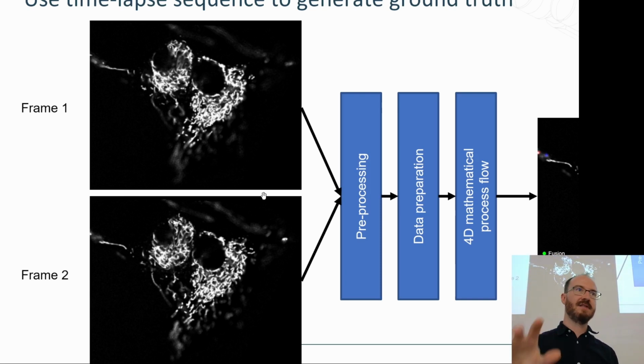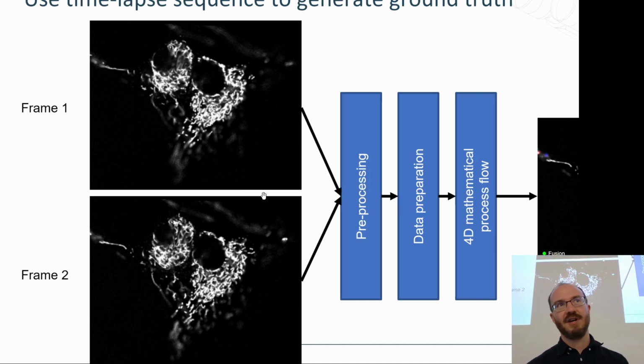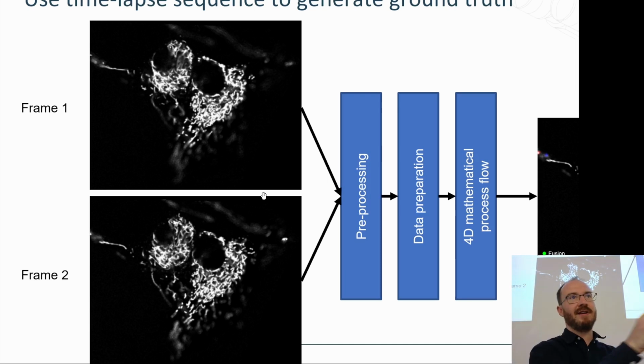This is the one structure. Now there are two structures associated to this one structure. So where between these two structures would that fusion point have happened, or fission point have happened? Like you understand, I need two structures to start to consider even where the location is. Because what if it just depolarized when you lost it? If there's something here and then nothing here, then you say, okay, well, in the same spatial area, there was something, now there's nothing, so it must have depolarized.